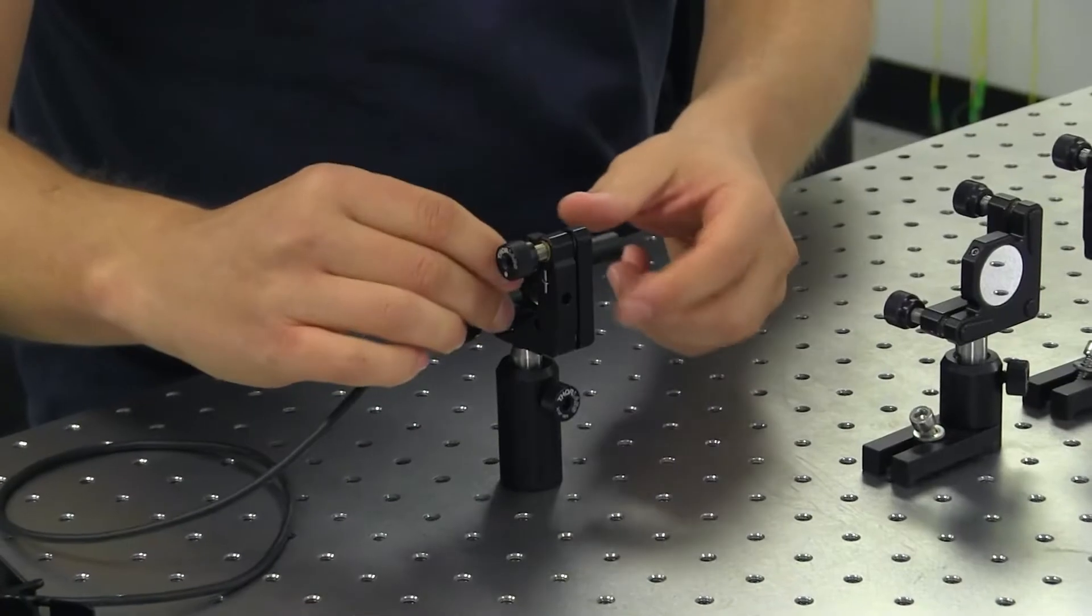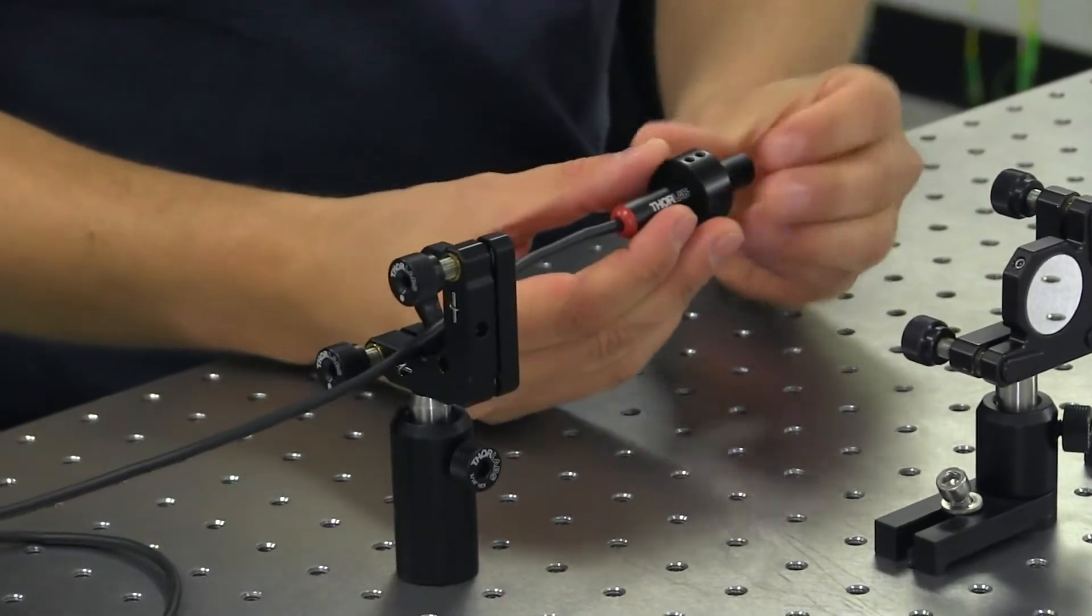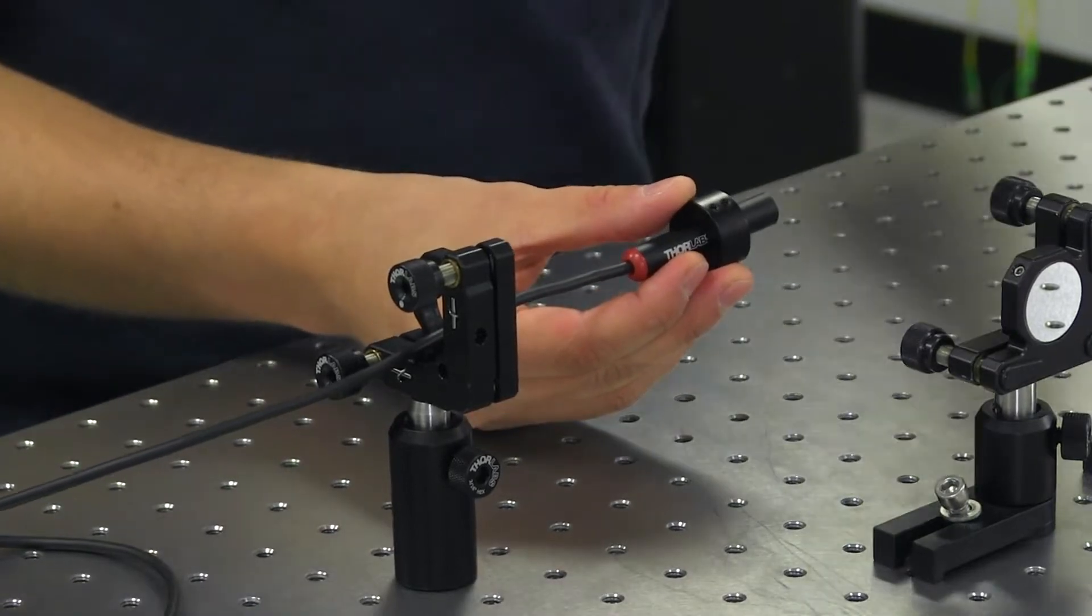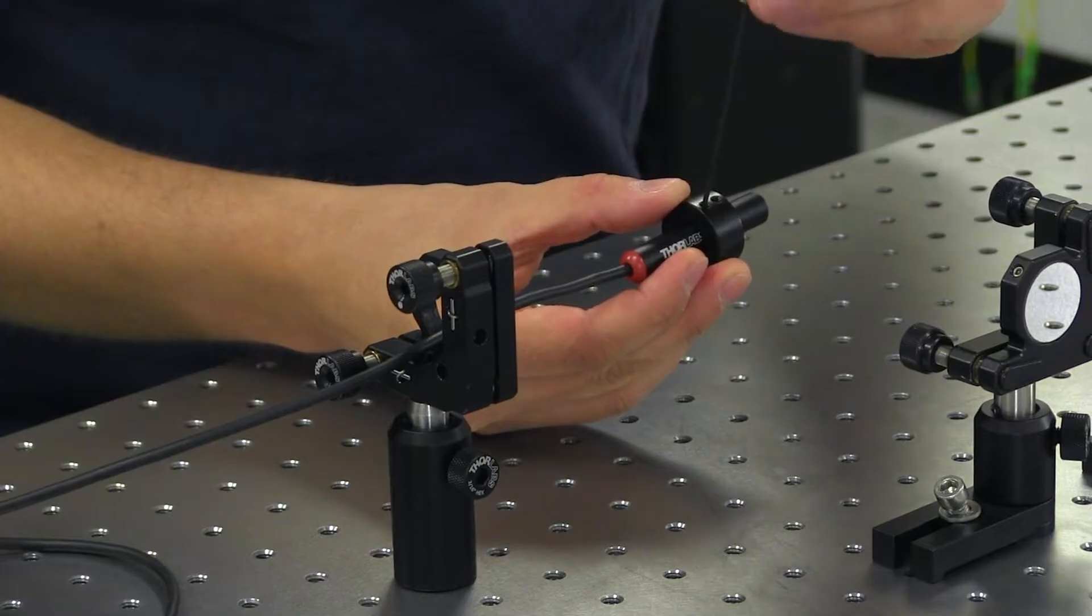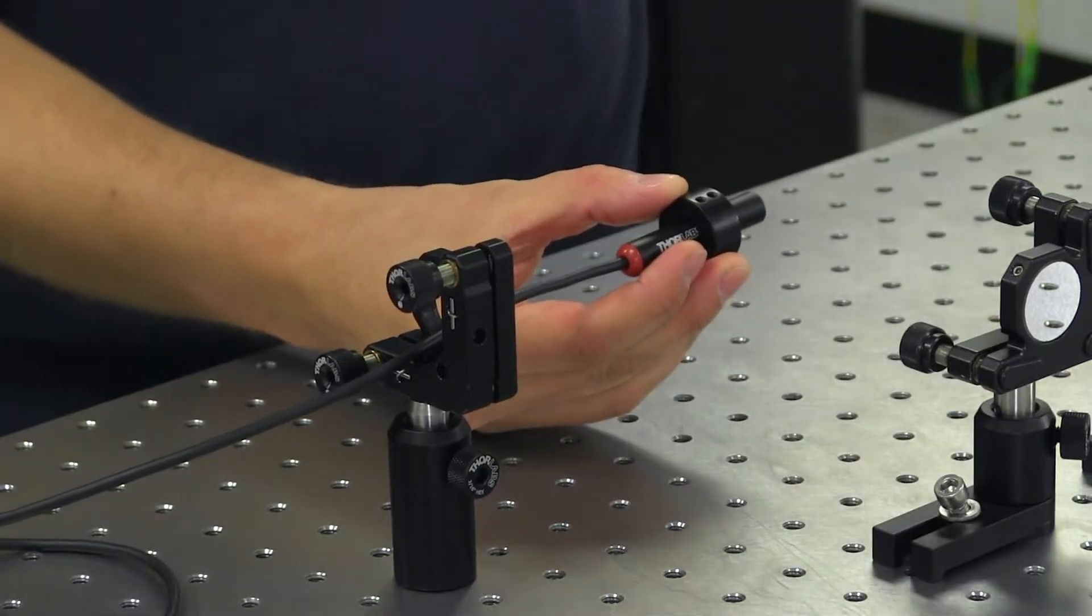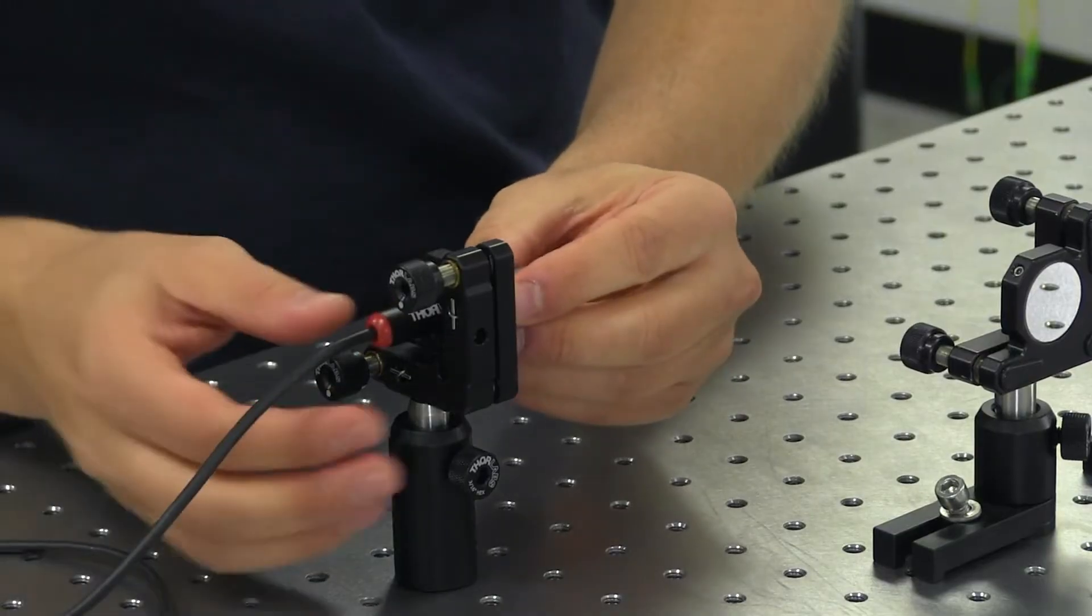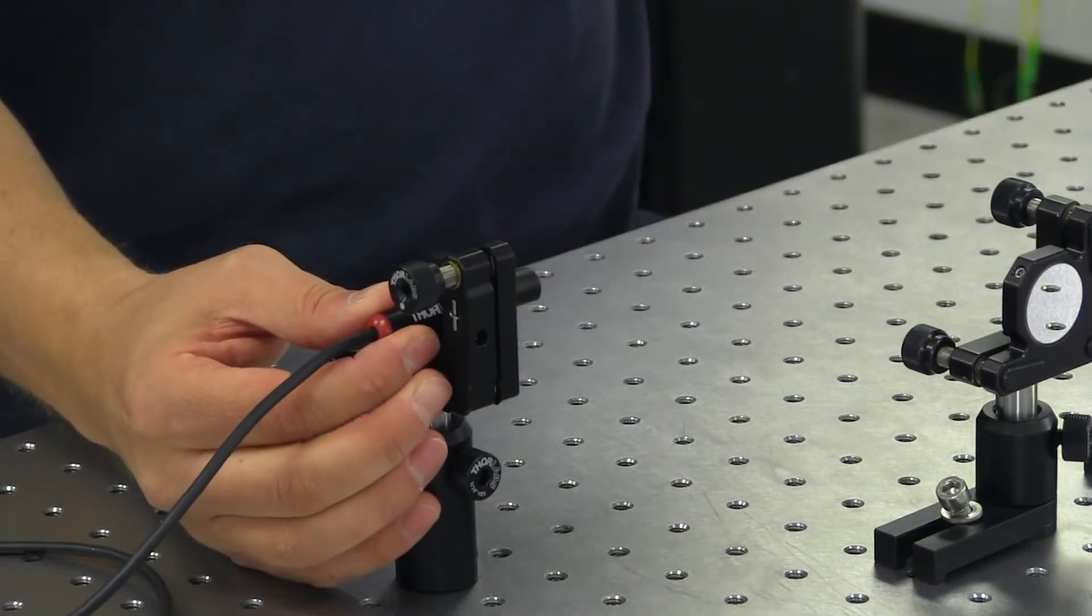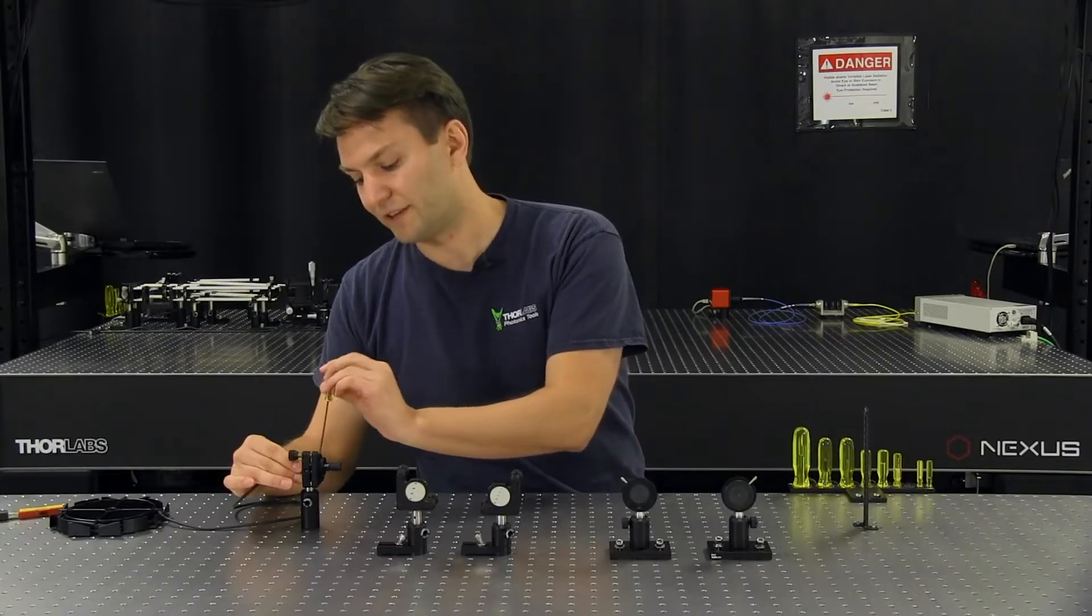So here I'm going to take my laser and mount it into my kinematic mount. Because the outer diameter of the laser is a little small, we're going to use an adapter to bring up the outer diameter to one inch. And we have nylon tip set screws within the adapter and also within the kinematic mount to ensure that we're not marring the surface of the laser or the adapter when we tighten everything in.